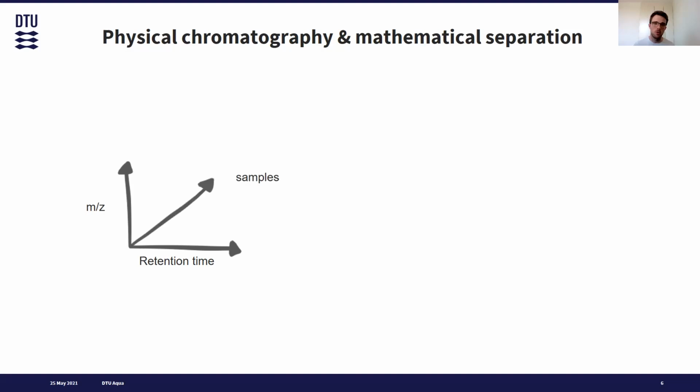And we can do that for a lot of different samples, and then we get a 3-dimensional data set. And if we were to assume that there is a universal DOM pool that consists of molecular features that occur across different samples, we could even try and employ a mathematical model that could describe the entire data cube here.